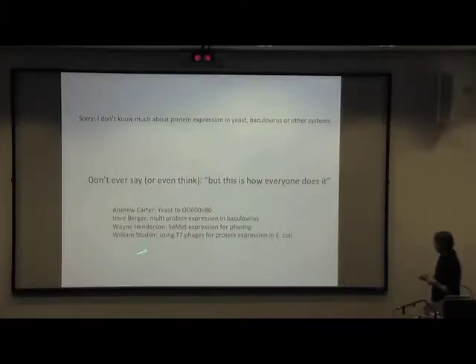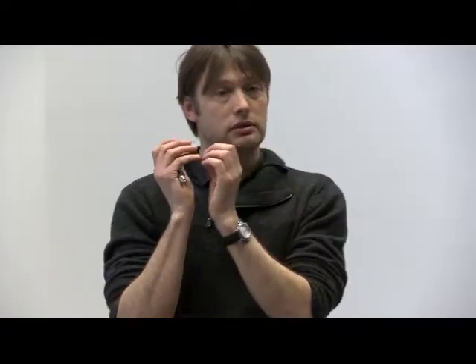And then I mentioned already Bill Studier, who, probably as a microbiologist studying phages, realized, well, actually we could make use of this. A phage that tends to invade an E. coli and then possibly lyse it, if you mutate it a little bit, you can make use of the system and then get protein expression like the way we do it now.